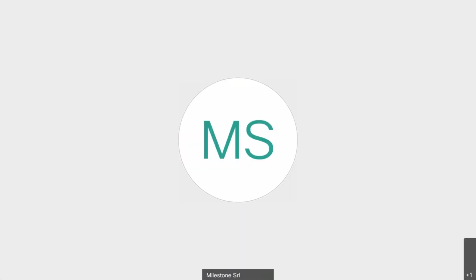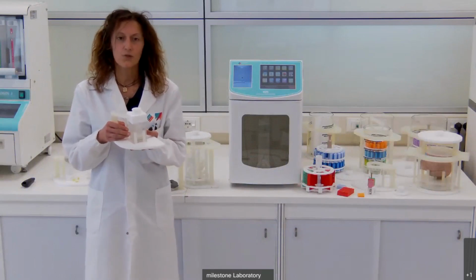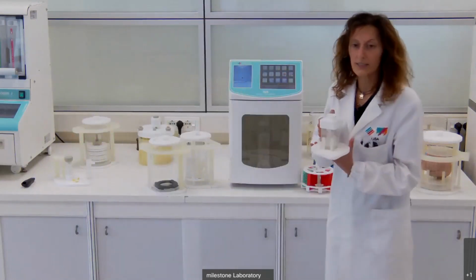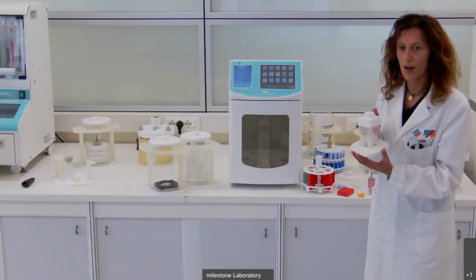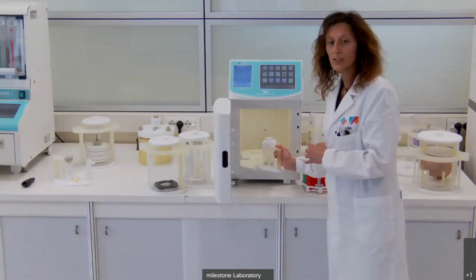Okay, we have a few other questions. So one question says, can you explain again how you do the special stains? The special stain, to perform it in COS, you have to use this kind of module. This module contains up to 16 slides. So, as you see, the shape of each of our module, this is the shape of the base of our module. This is important to allow the correct position of the rack inside of the COS cavity.